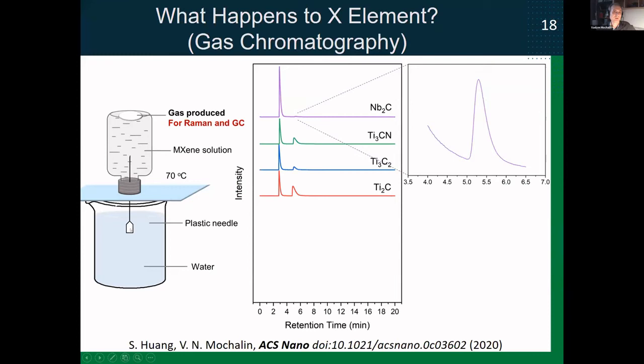And indeed in each of these reactions, we collected about half a milliliter or 1 milliliter of gas phase. And then we analyzed this gas using gas chromatography. Okay, so now it becomes kind of a detective story.